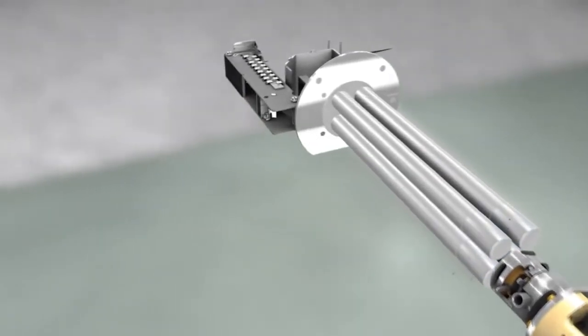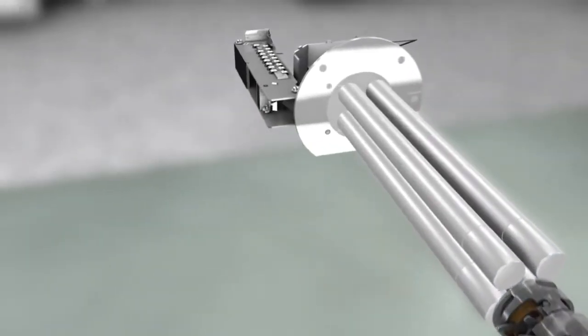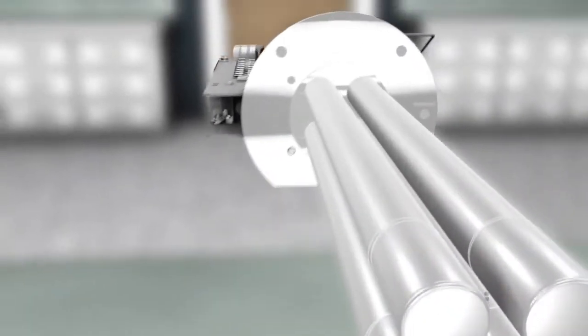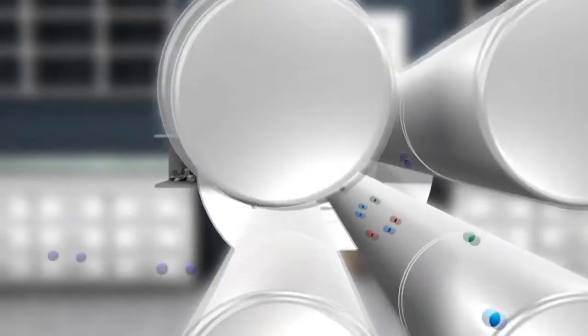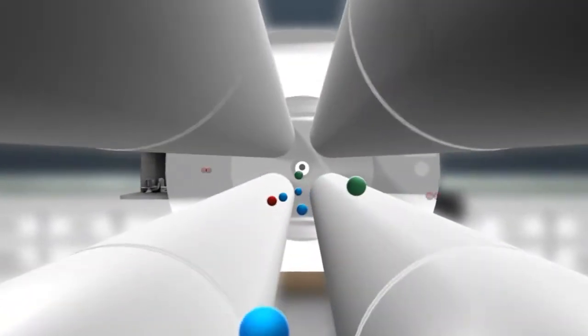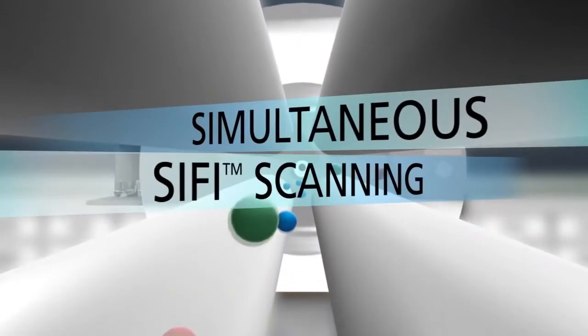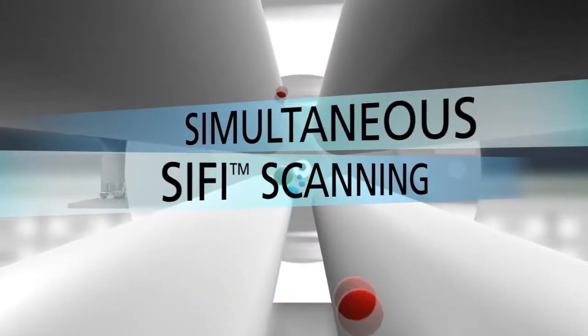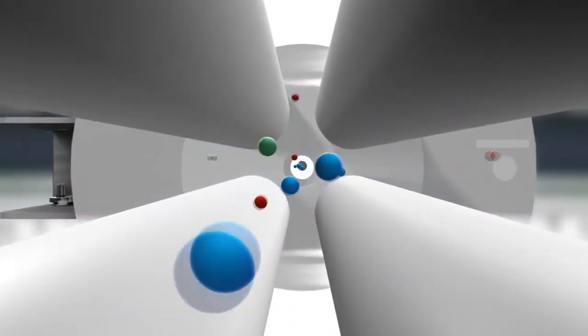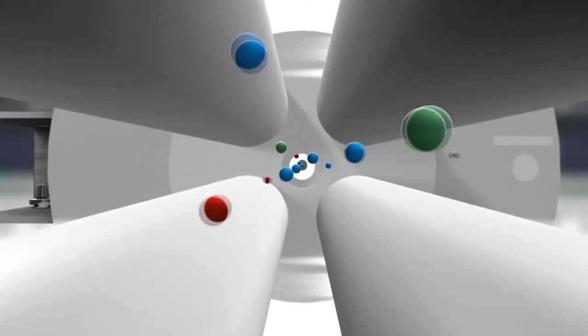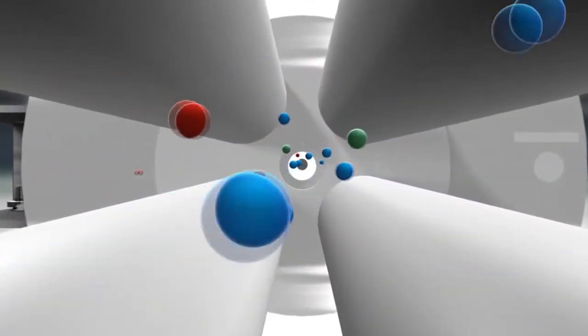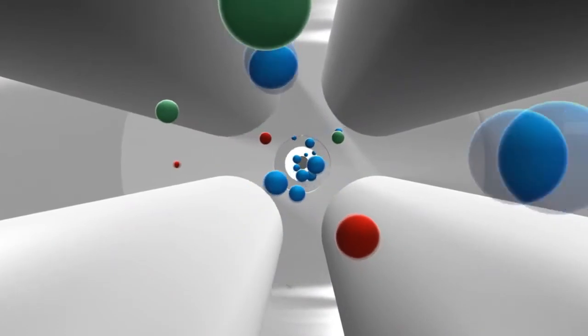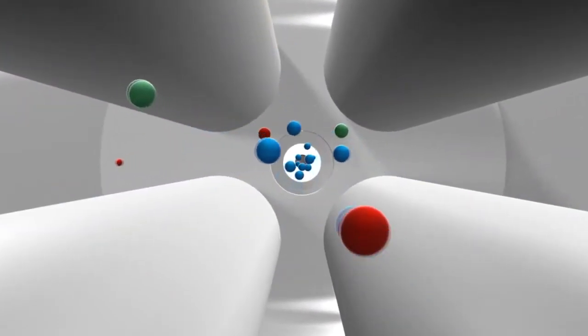The powerful analyzing quadrupole offers exceptionally fast scanning rates for greater spectral fidelity. A convenient SCI-FI option lets you simultaneously collect data in both selected ion and full ion scanning modes for greater analytical flexibility.